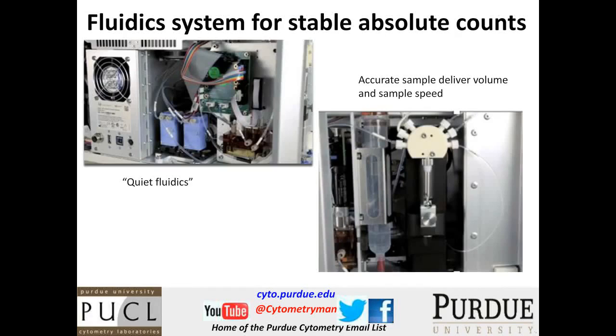So this is just a photograph, again, taken with the back off the instrument. I'm not sure that you're supposed to do this, but unfortunately, when an instrument comes in my lab, I tend to pull it to pieces to see how it works. And this gives me a very good understanding of how the instrument actually performs. You can see the quality of the construction and how the whole system is designed, how easy it is to repair. And this is the photograph I took of the back of the system.